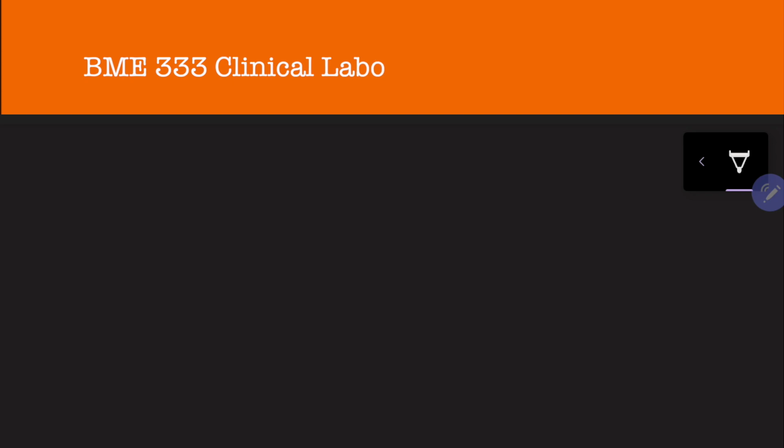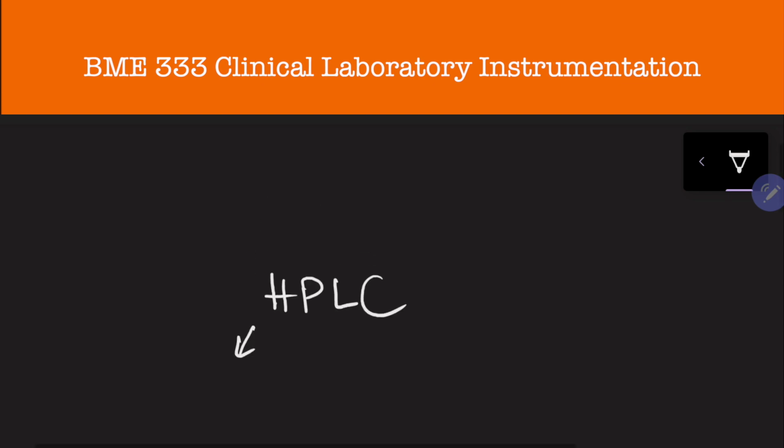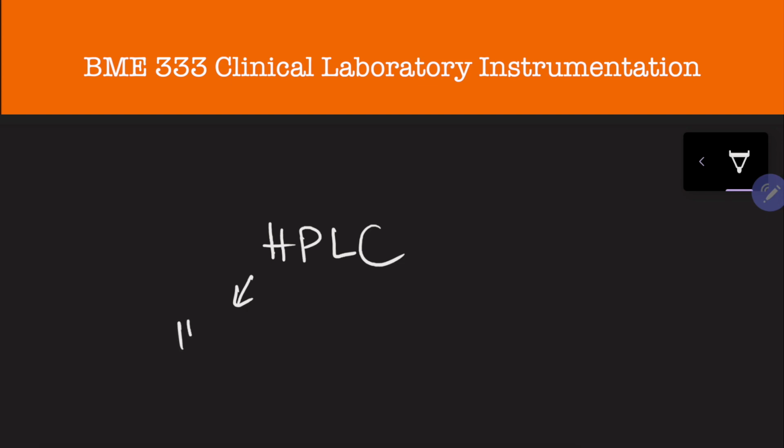What we're interested in today is basically HPLC, High Performance Liquid Chromatography, and it's sometimes also called High Pressure Liquid Chromatography. We'll see why it's called that in just a moment, but before we get to that, let's first understand the underlying motivation for it. Why are we so keen to study this?